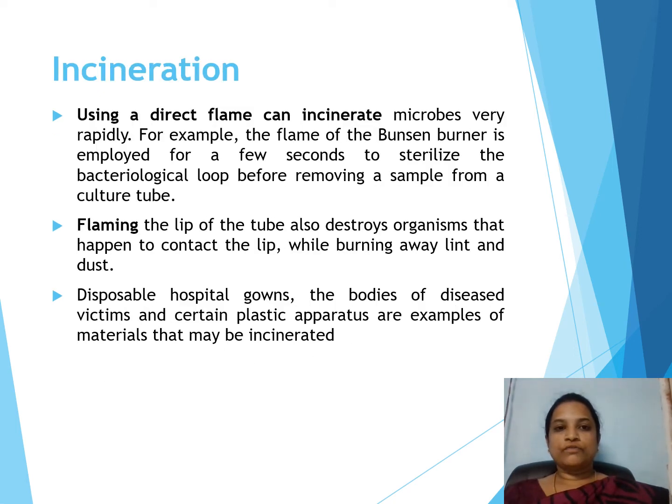The next method of physical sterilization is incineration. It uses a direct flame to kill the microbes rapidly. For example, the flame of a Bunsen burner is employed for a few seconds to sterilize the bacteriological loop before removing a sample from the culture tube.